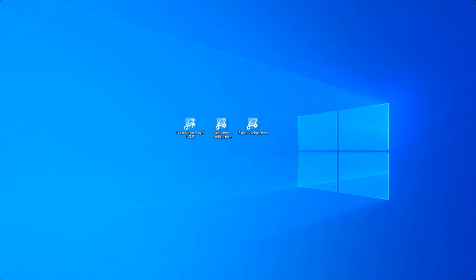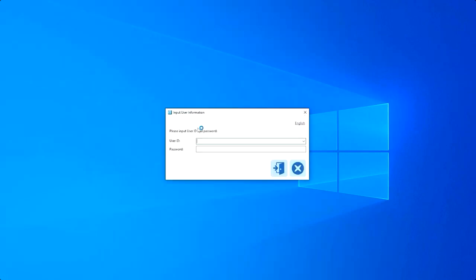Using the flags in LabSolutions Insight provides the user with efficient tools for data review by exception, maximizing the time of the analyst. Select LabSolutions Insight, enter admin as the user ID and no password, and hit enter. Open your data in LabSolutions Insight.